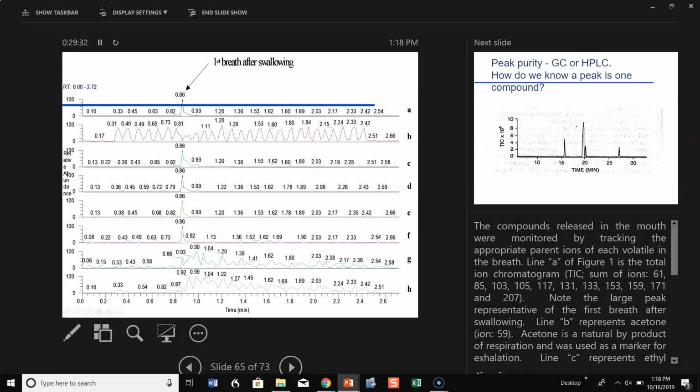And this is now a real example. So this is the mass spectrometer. It's monitoring breath. He is breathing. That's a good sign. This is his exhale breath. If he's inhaling, well, you don't get anything in the mass spectrometer. Exhale, inhale, exhale, inhale, and so on. And that's acetone. We all exhale acetone. It's part of our metabolism. So the machine is measuring acetone in our breath.